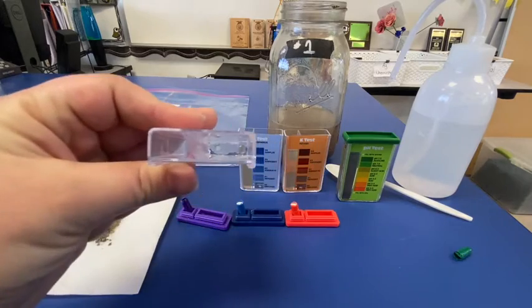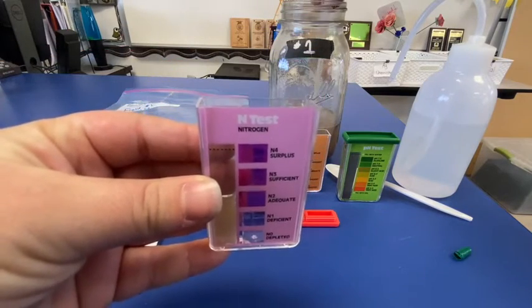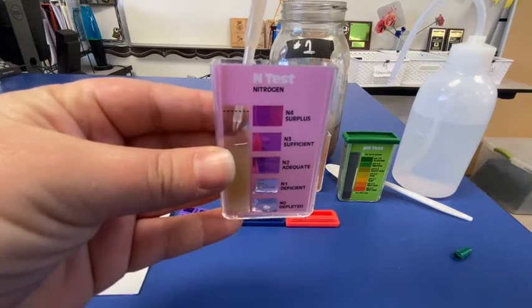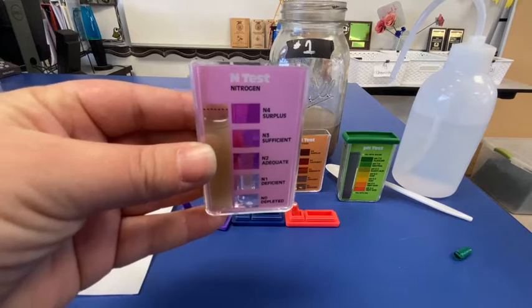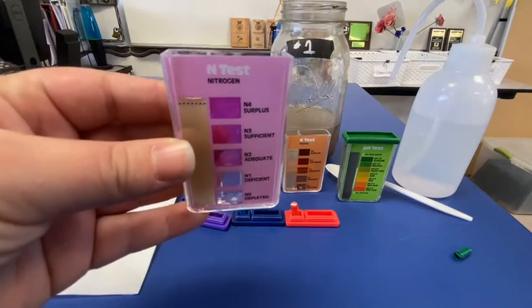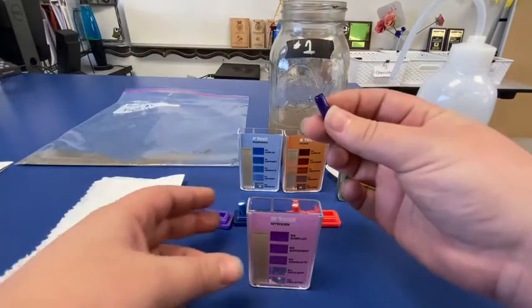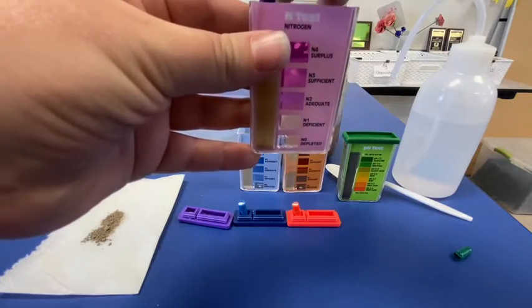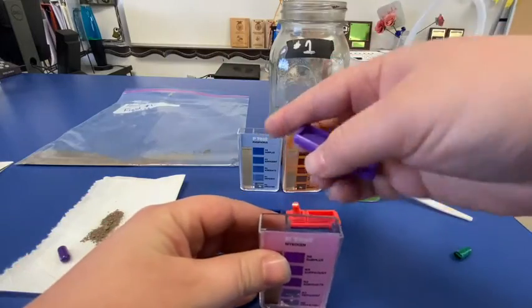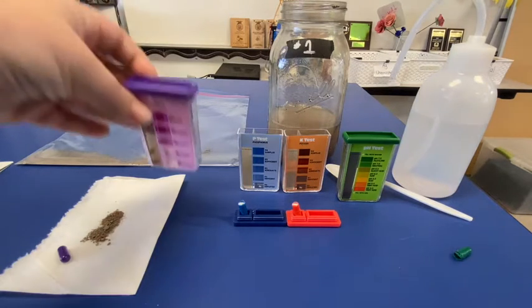In the nitrogen test, there are two compartments. I'm going to fill up this first compartment to that fill line using my pipette — making sure I try not to get any of that organic matter that's floating. I just want to get that soil water, making sure it goes all the way to that fill line. Then I'll grab our capsule of indicator and put it into our nitrogen test. Close the lid. This one needs to be shaken very, very well. Once this is shaken up well, I'm going to let it sit for 10 minutes.